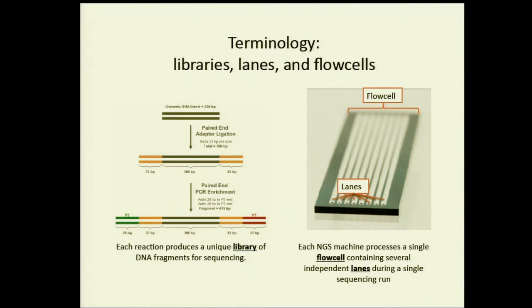Also, you can have particular errors that just belong to a lane. Let's say someone sneezes on one of the lanes by accident. That's also possible. Anything can go wrong, and you really want to divide up the data into the smallest unit possible, so you can really find errors that are unique to those smaller pieces.